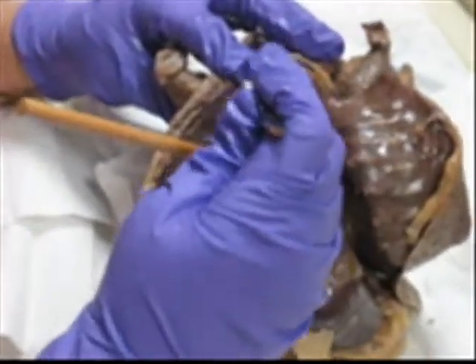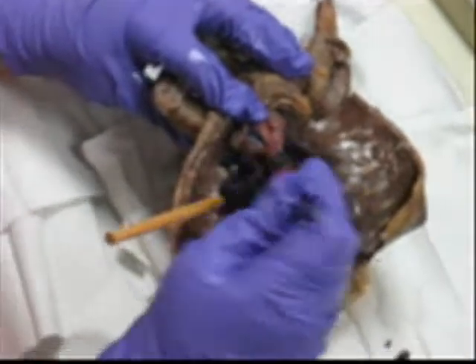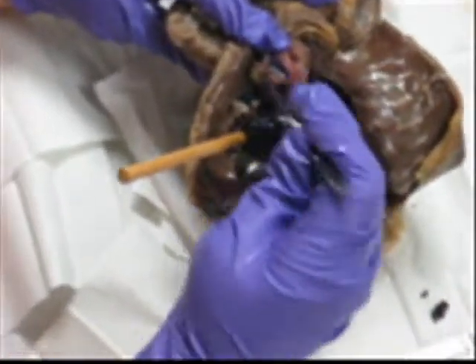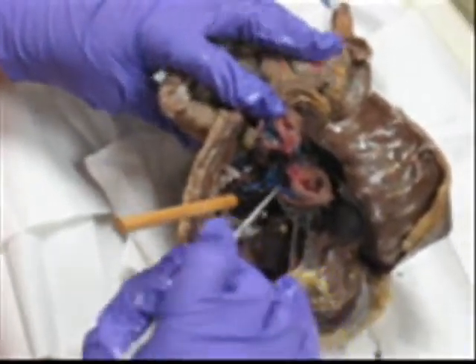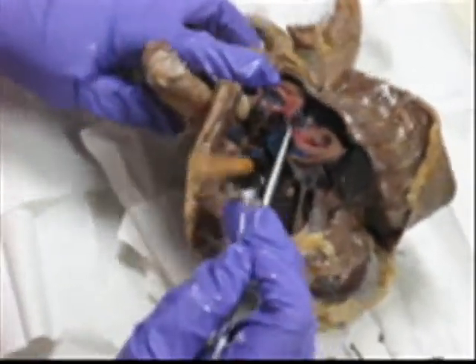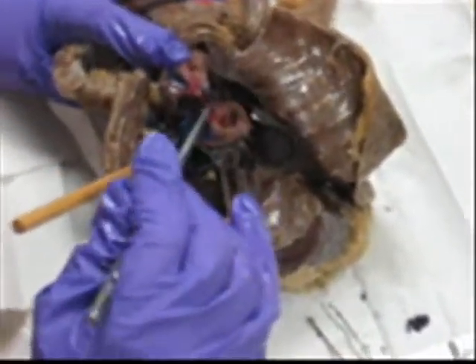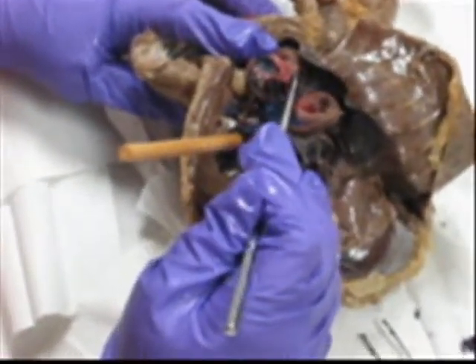Over here you can see very nicely in the top one. Remember, this chamber is the right atrium, and so is this one over here. Left atrium — much smaller.